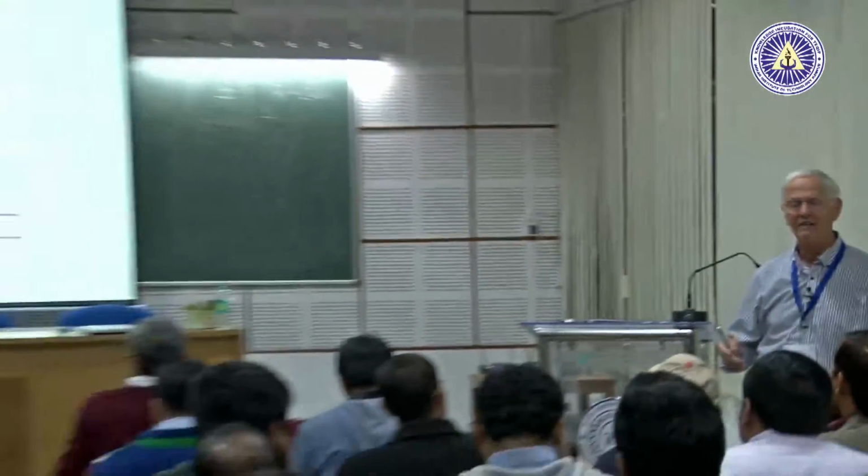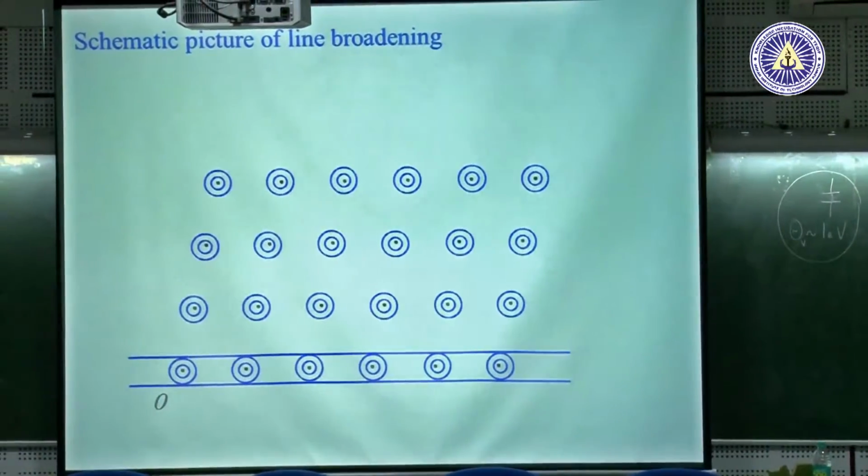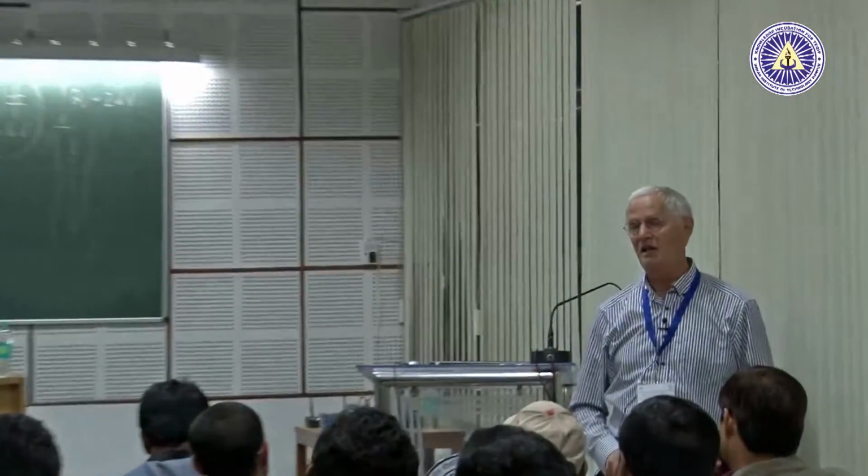Now, if you reduce the crystal size, then you see something like that, or you should see something like that, that each peak is blown up, and the blow up is uniform in reciprocal space. Of course, it becomes anisotropic if your scattering objects are very exotic. For example, if you have needles, or if you have chapatis. In my country, I would say pancakes, but here I can say chapati, which is much better.